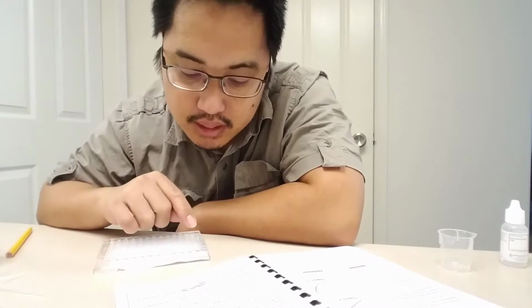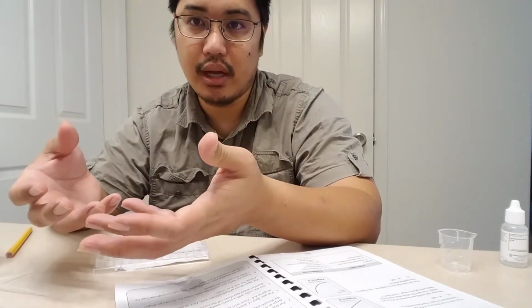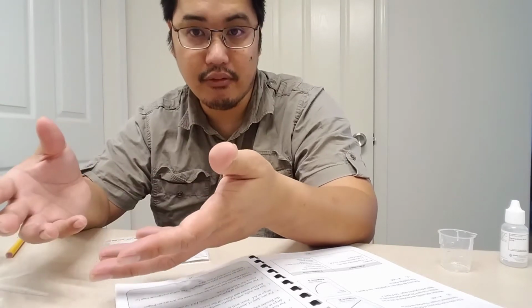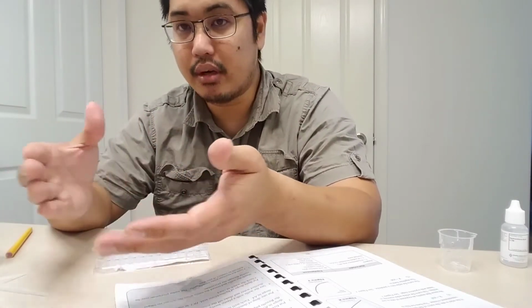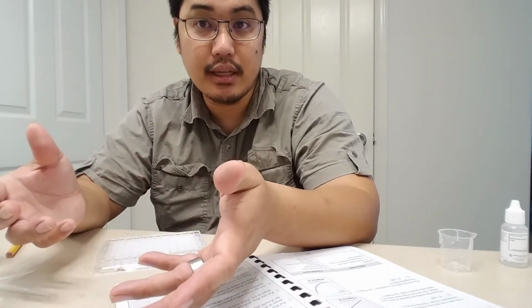But what you want to do in your experiment is don't touch it, just watch it. And I can see that first X is starting to get a little bit cloudy and hard to see. You don't want to shake it, because notice how I was shaking it and looking, shaking it and looking. I'm introducing a variable, and I'm making it harder for myself to control the experiment because it might depend on how vigorously I shake it.